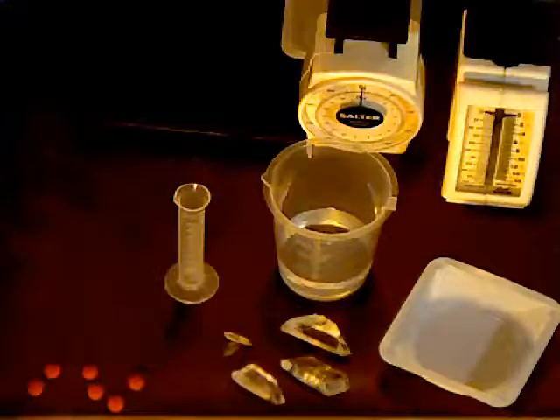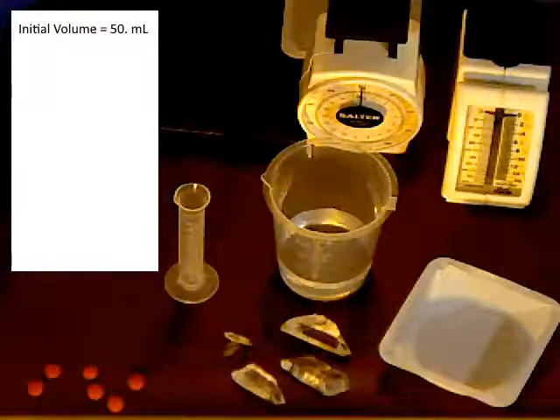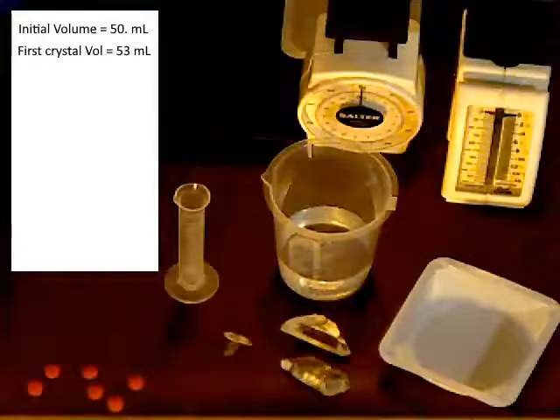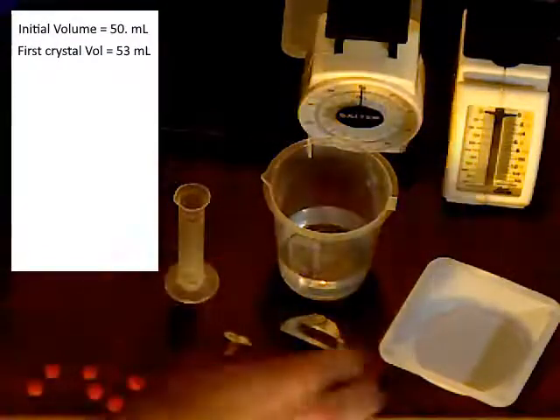To do volume displacement, I simply record the beginning volume. I'm going to use the beaker. I don't happen to have a graduated cylinder that's large enough right now for these large crystals. And so I would record the initial volume, and then I would immerse my quartz crystal. The volume goes up a little bit because the crystal displaces some water. This is water displacement. Volume goes up as I add a crystal.